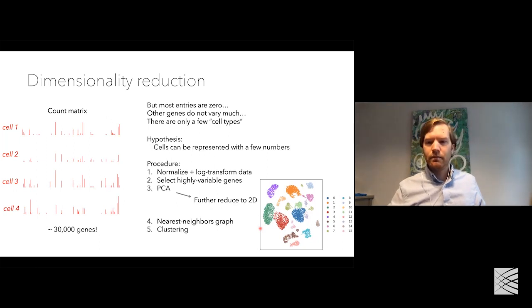Stephen, there's another question from the audience member about the assembly of the count matrix. And the question is, are there many detailed post-processing steps to clean up the data before getting the count matrix, or does most of this happen afterwards? Great question. And it leads into 2 of the things that I'm going to touch on in more detail. So I will cover that for sure. Great, thank you.